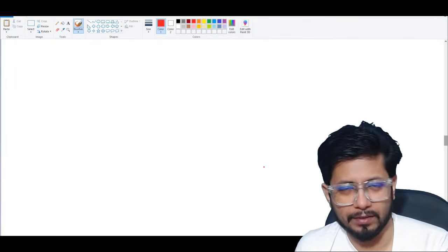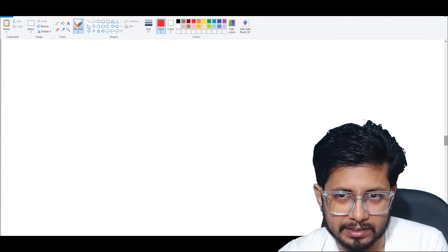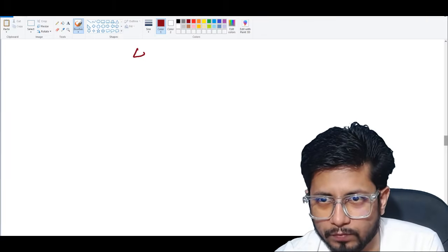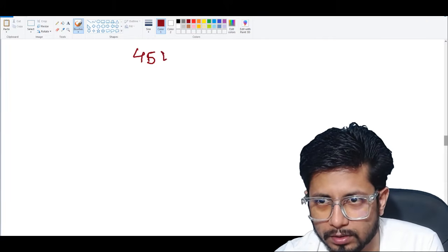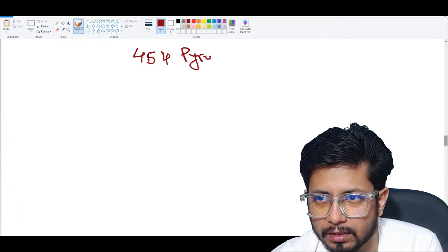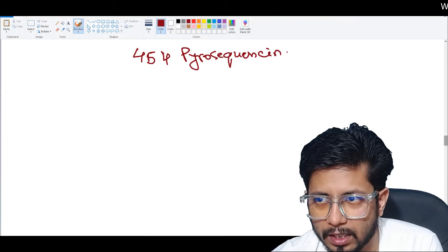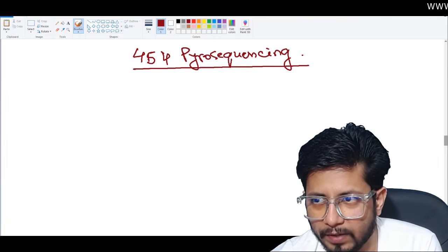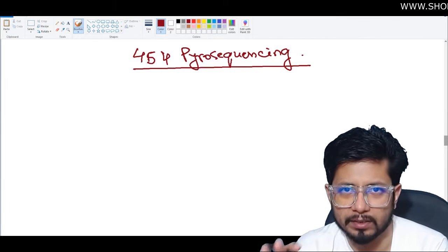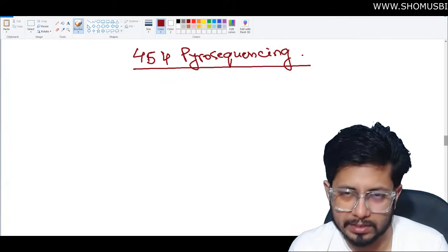And in this series of lectures, we are talking about the DNA sequencing methods. So today's discussion is another type of DNA sequencing, and today we're going to talk about 454 sequencing, 454 pyrosequencing. 454 sequencing, pyrosequencing is also called Roche sequencing, whatever term you use. These are all the same method, same technique of sequencing a DNA.